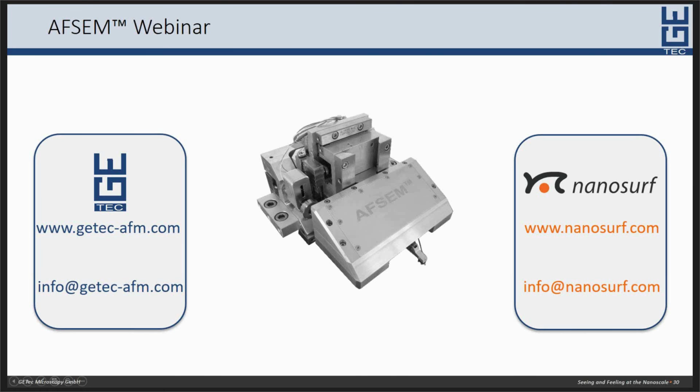Okay, and then we have one last question. Can I do quantitative nanomechanical measurements with the AFSEM? Of course you can. And you can do that by taking force volume maps or by doing point-by-point force distance curve analysis of your sample at the exact spot which you have identified with the SEM and where you would like to do the nanomechanical analysis. For this, I would suggest that you use our calibrated diamond tips for the mechanical measurement.